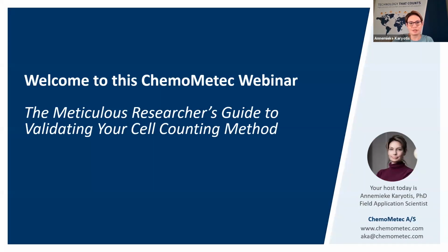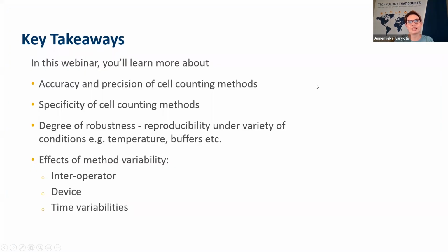So without further ado, one of the key takeaways we'd like to take you through this afternoon is validation of the cell counting method. Although all of the data I'm taking you through is with our newest instrument, the NC202, the experiments and the theory behind it are applicable to any cell counting method. So it should be applicable to any of you.